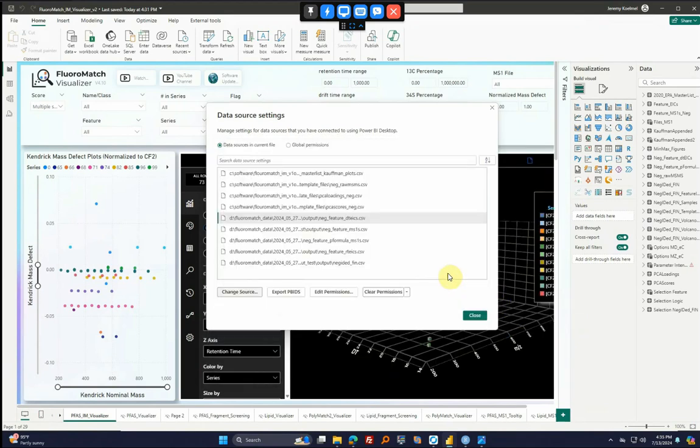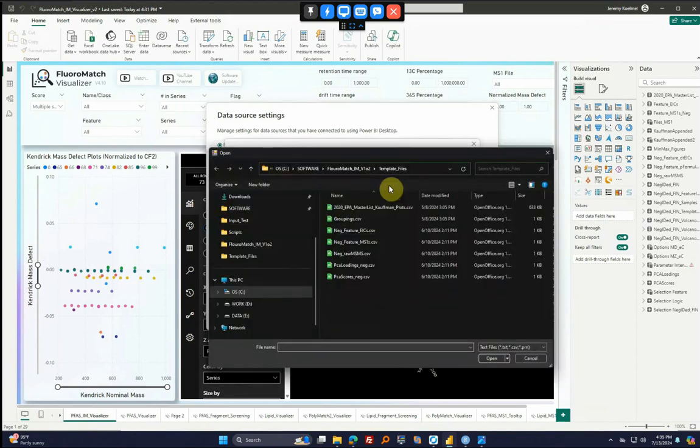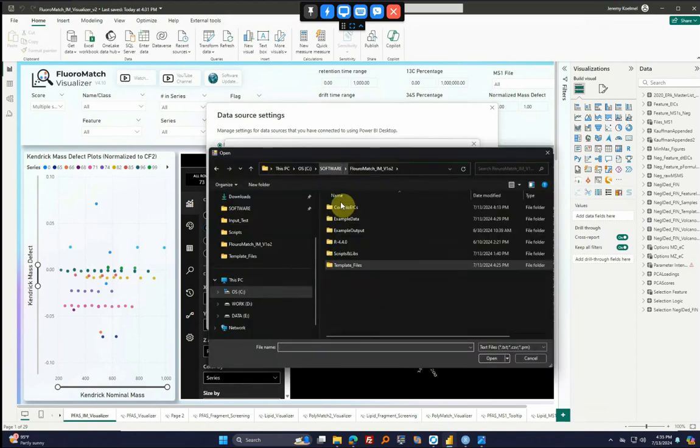Again, you might forget what the name is, and then look back. Okay, it's drift time EICs. There's drift time and retention time EICs, so make sure not to confuse them.